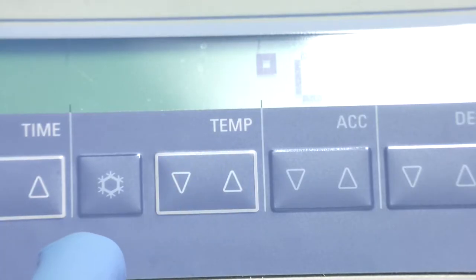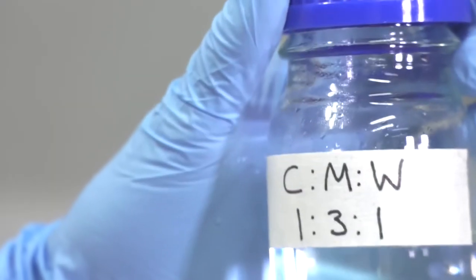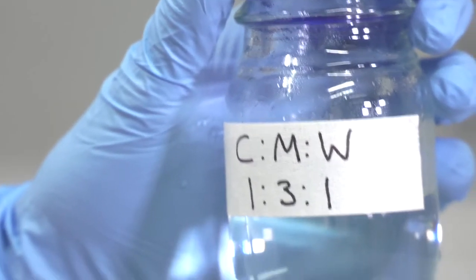Before we start the extractions, we need to prepare our equipment. Cool a centrifuge to 4 degrees C. Prepare the solvent, usually chloroform, methanol, water, in a ratio of 1 to 3 to 1, and place in an ice bath.